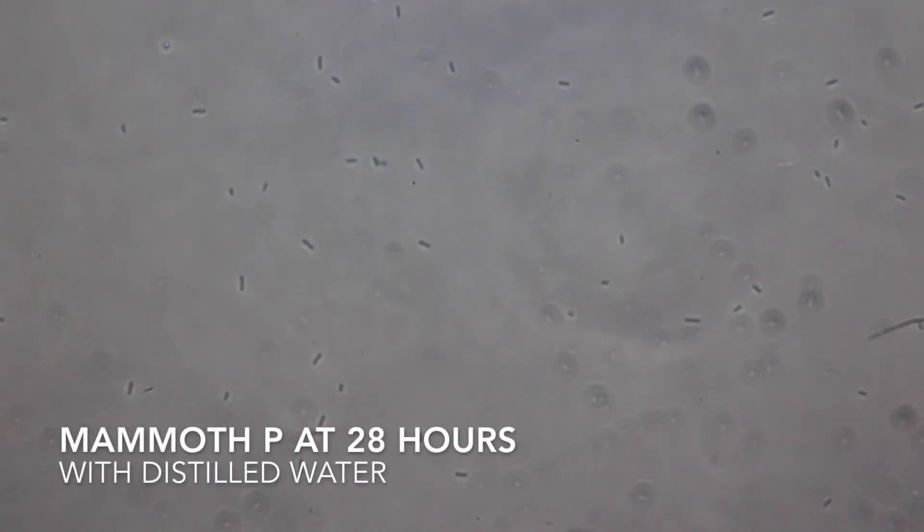This is just Mammoth P and distilled water at 28 hours — no food sources whatsoever. As you can see, we're getting quite a bit of motile bacteria, not as much biomass as the other slides, but possibly a little bit better morphological diversity. I think it speaks to the quality of the product — there's a lot of good biological activity — and this particular sample I pulled was from a bottle I've had for at least four months just sitting on a shelf at normal room temperatures.